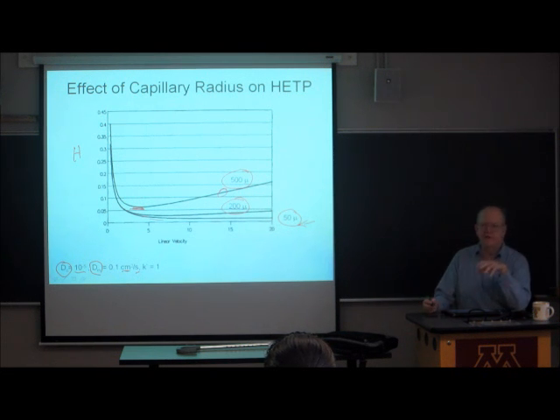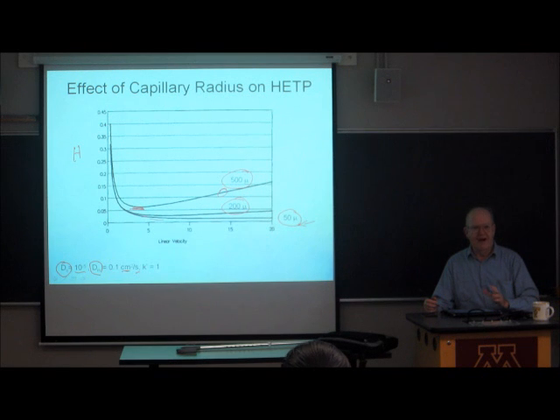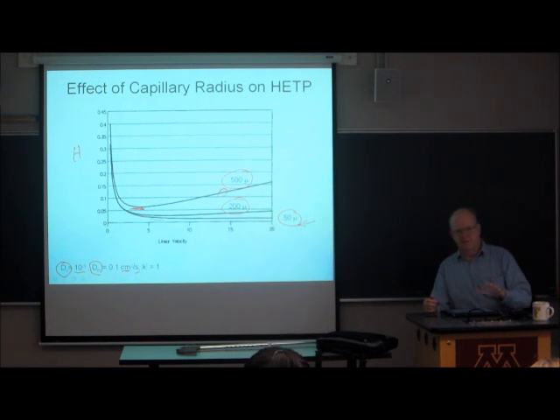As we go through here, you'll find out that gas chromatography is a lot faster than liquid chromatography. By a lot faster, I mean a lot. Like factors of 10 and 100 times. I have seen people do GC on a time scale of 1 millisecond. The fastest LC I've ever seen is about 2 seconds. They're not great separations, but it just indicates the magnitude of the time scales involved here.